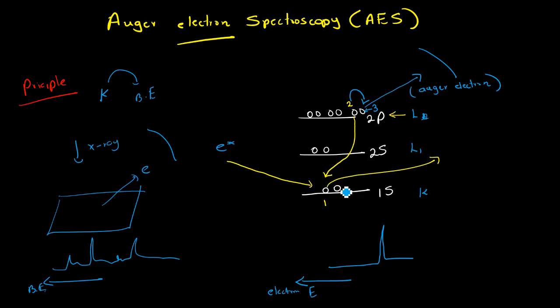When the surface becomes more positive, the negatively charged electron will have more attraction to the surface. So this electron will have to spend some more energy, because the surface is positively charged and it needs to overcome the positive charge also.